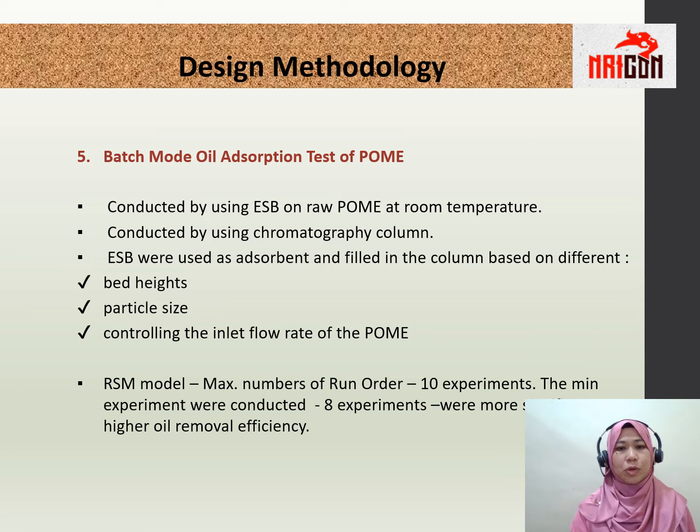Okay, about the batch mode oil adsorption test of palm oil mill effluent, it is conducted by using ESB on raw POME at room temperature and conducted by using a chromatographic column. ESB were used as adsorbent and filled in the column based on different bed heights, particle sizes, and controlling the inlet flow rate of the POME. The RSM model maximum number of run order is 10 experiments. The minimum number of experiments conducted is 8 experiments.